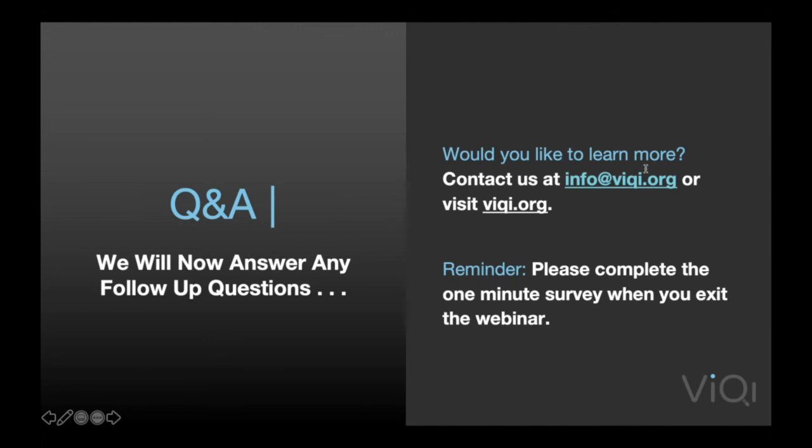can tune. And in fact, it is tuned automatically in ViQi systems and others, where it sort of selects an area with an appropriate number of features. Those curves are very broad. So if you have a dip, it's way out, ridiculous territory. You have thousands and thousands of features.